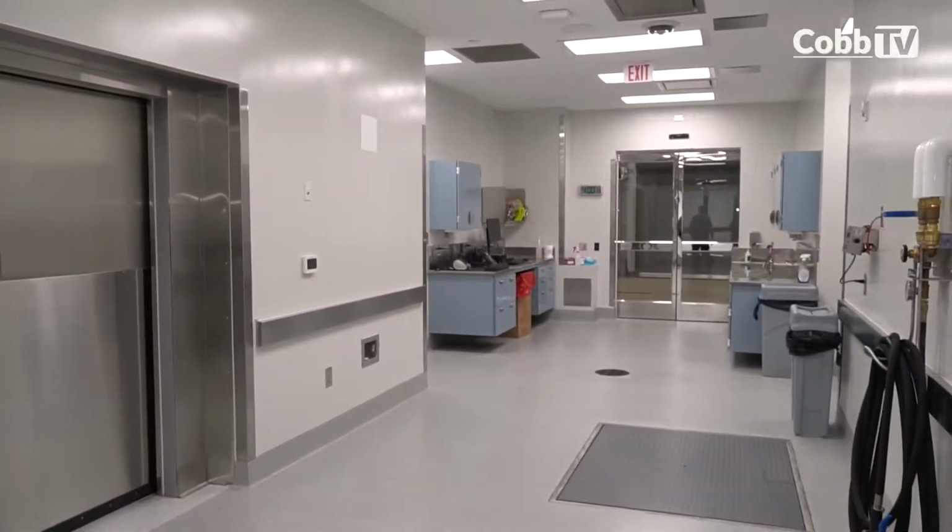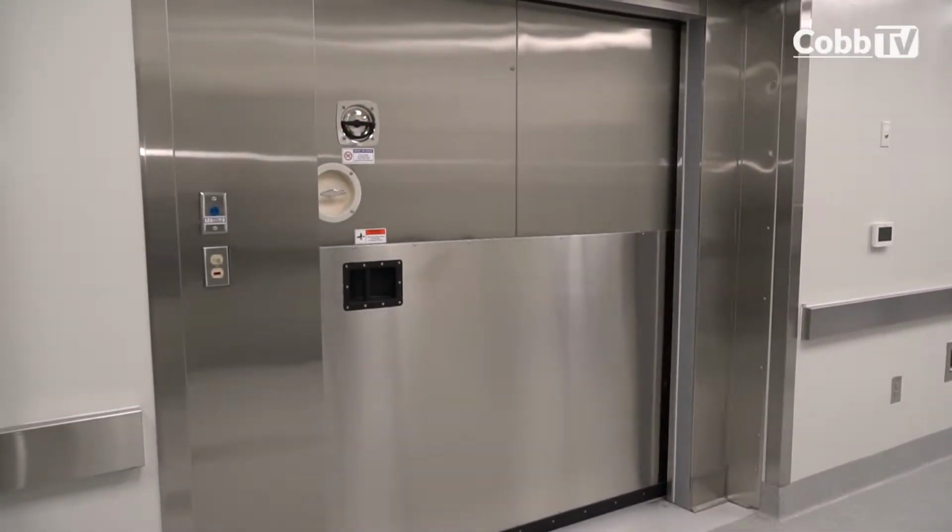In the mornings, those cases will be brought out. We work 24/7, 365. At any point, we're capable of responding to a death, no matter where it is in the county. And at that point, the next day, we will bring out the cases that have been brought in over the previous day for an examination. We do exams routinely 6 days a week, and sometimes 7.